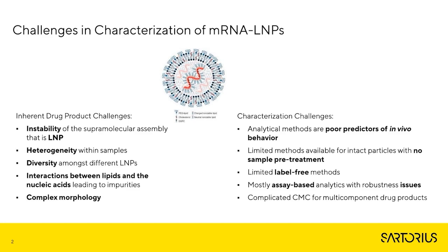So that's where you have to think more intensely about the characterization and the other manufacturing challenges that you are facing with LNPs. And when you do that, you face certain challenges, and people have faced them, and some vaccines and therapeutics that are already on the market, like Dan described, have at least partially solved those problems.